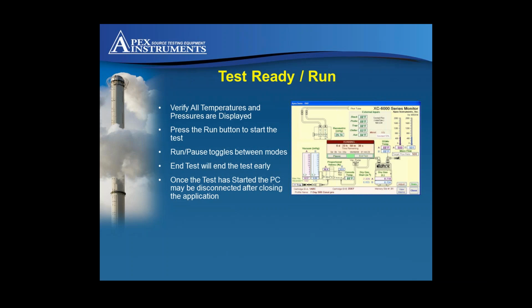You got individual DGMs. You can see these are all live values in real time. You can see the amount of vacuum that each system has currently on it. You can see the flow rate, what its targeted value is and what it is. And you can also see the DGM values down there of what the volumes are. This volume will be in the exported data file, and all of those temps too.